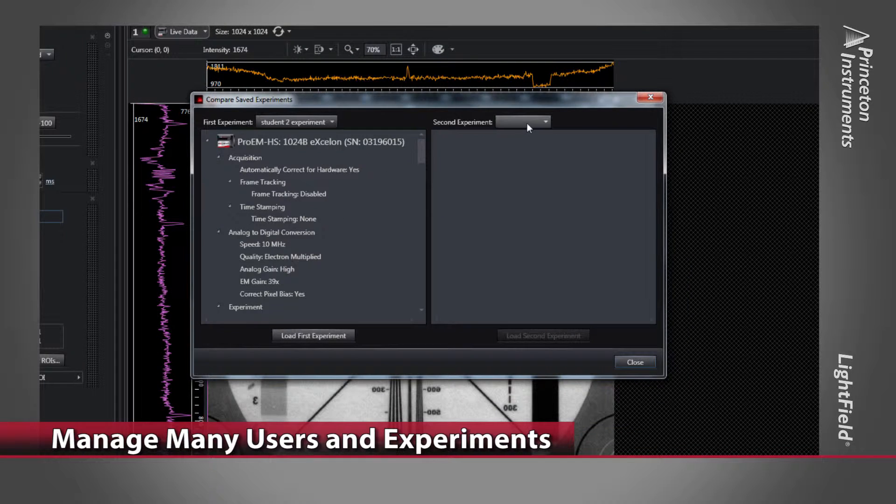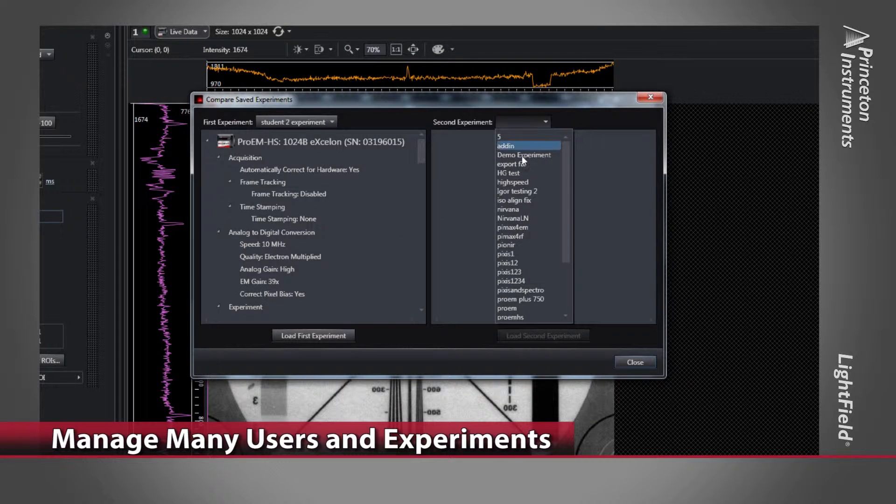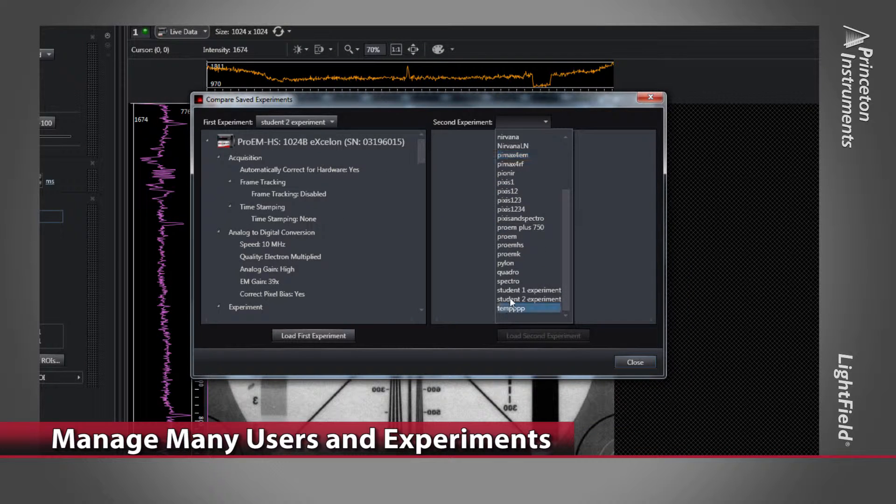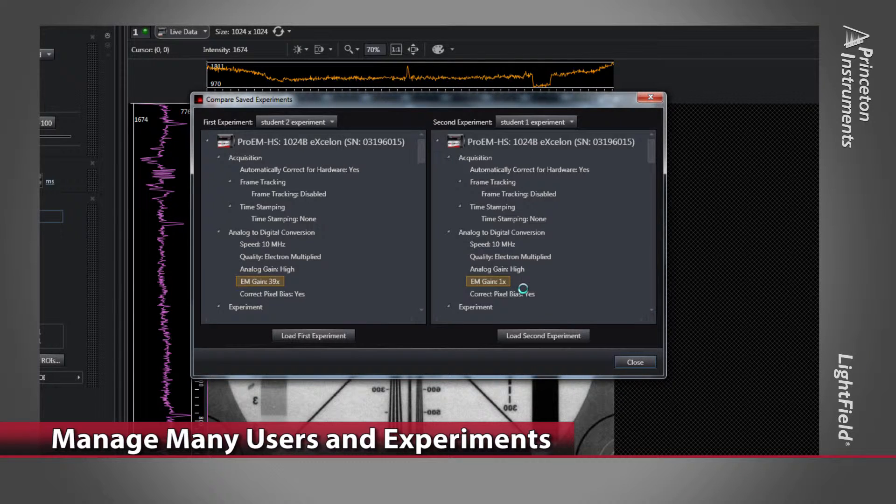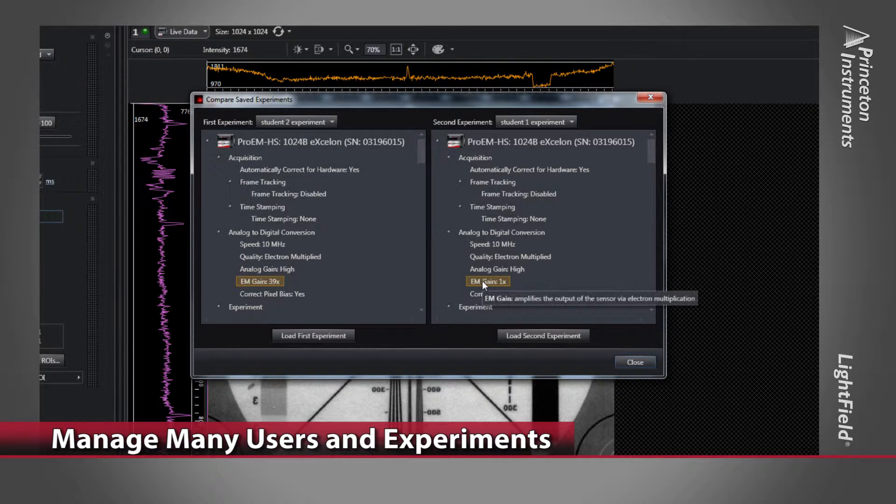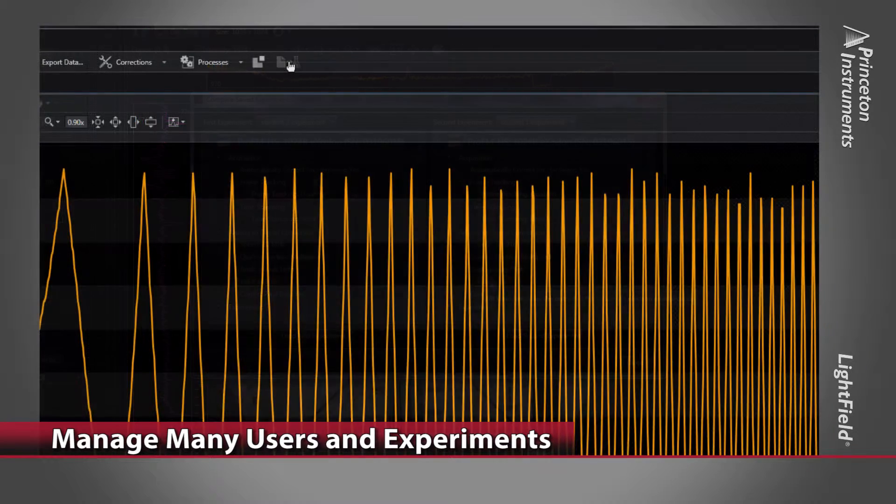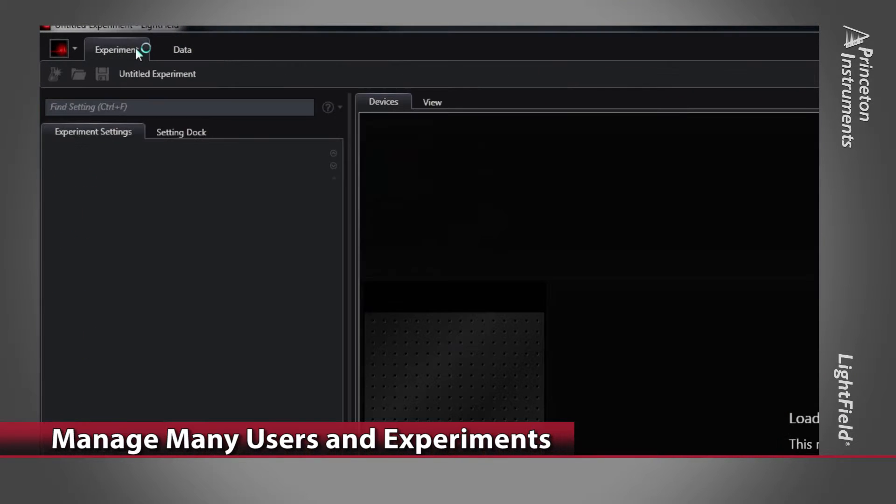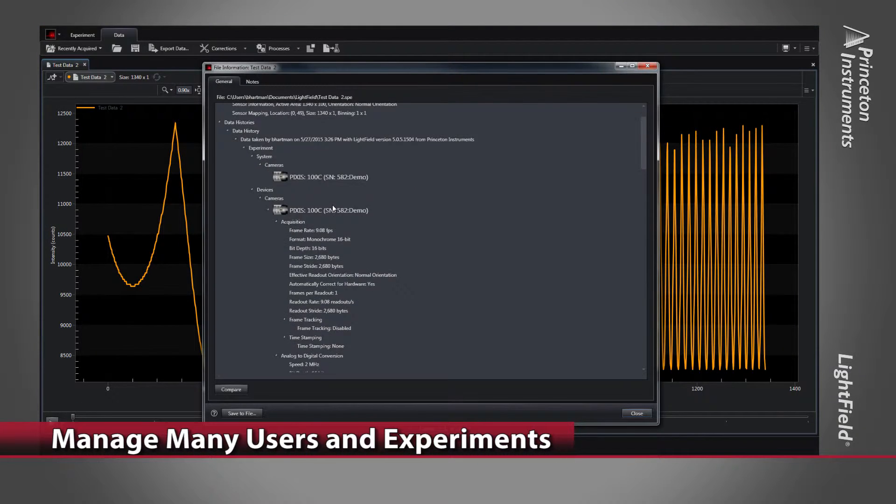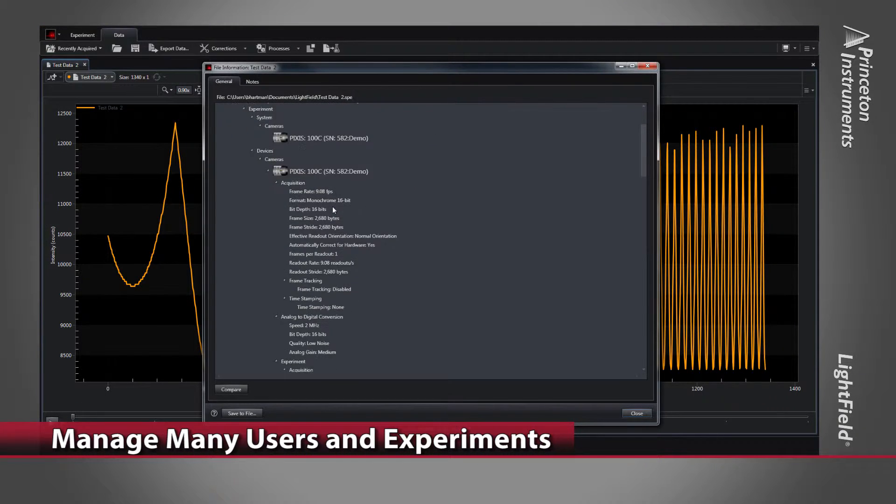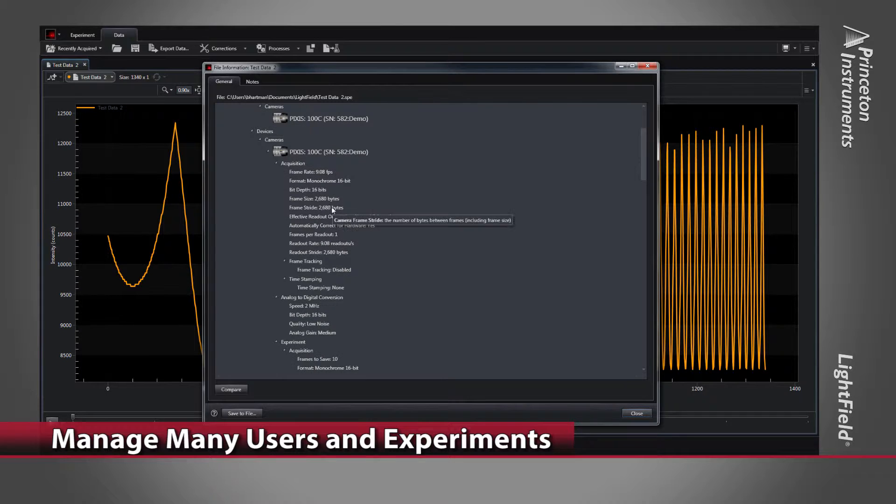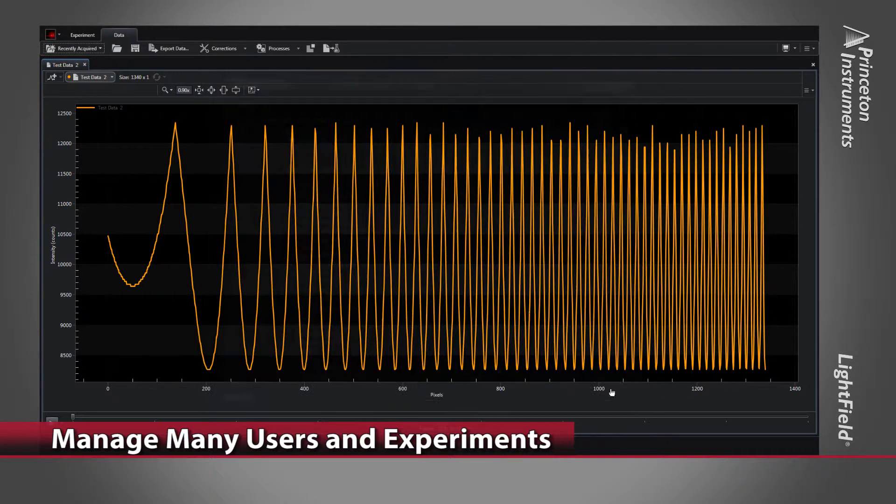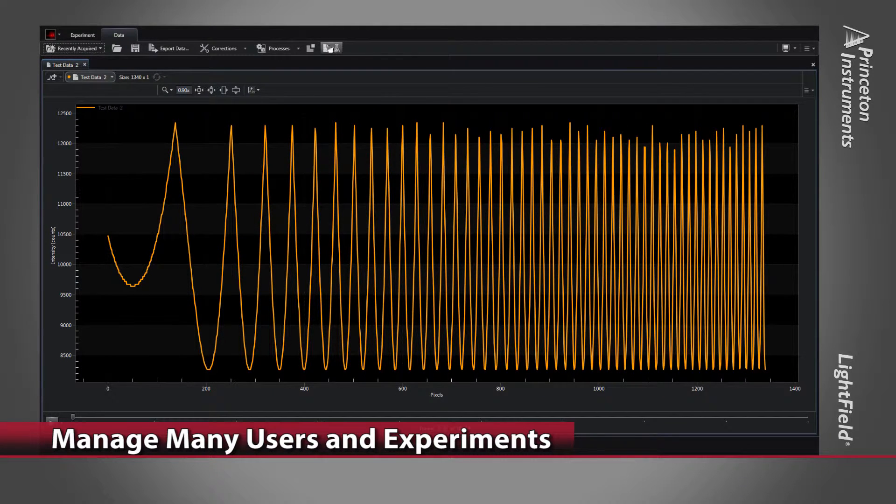Lightfield also makes it simple to compare two different experiment parameters. See how the differences are highlighted and easily discernible. Users can even recreate experiments directly from the data files. All settings related to the camera and spectrometer are stored in the header file and can easily be retrieved from the file information dialog.